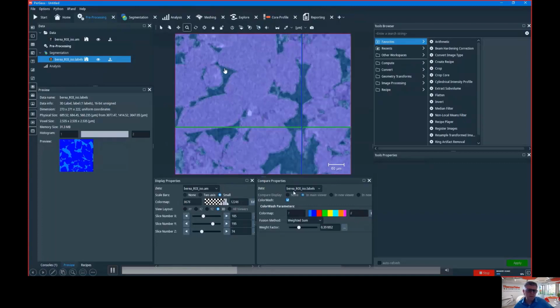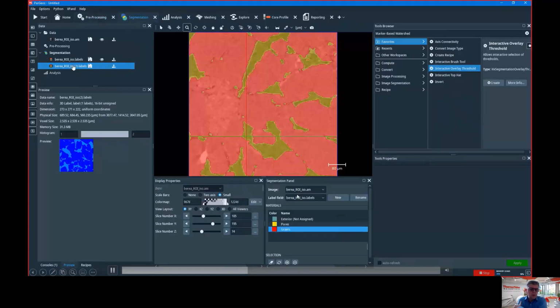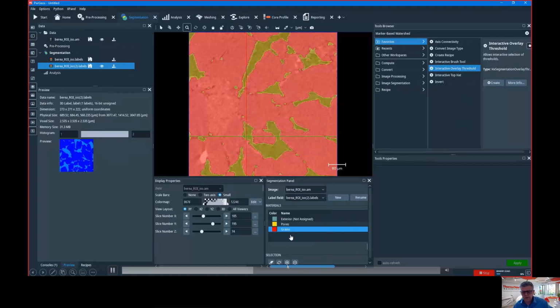So it's a bit different approach in the user interface to go more straight to the workflow. What I'm going to do here, there are plenty of ways, but I need to keep only the pore space and throw away the grain. So I choose this way. Maybe I could have done differently. I duplicate the data and I throw away the grain.